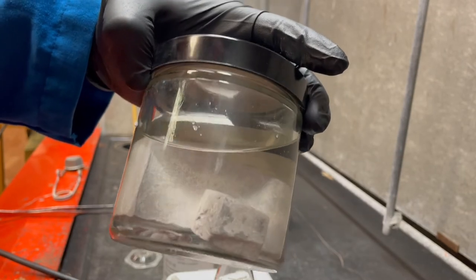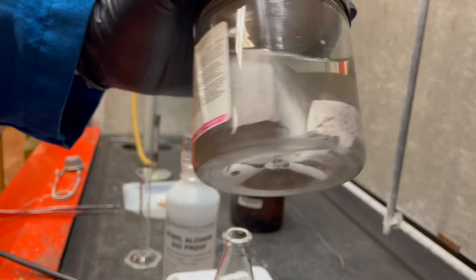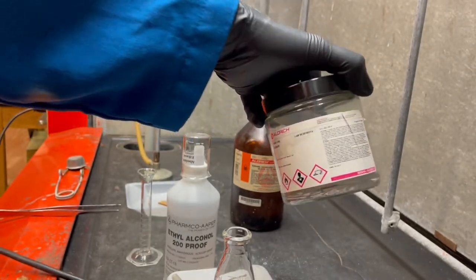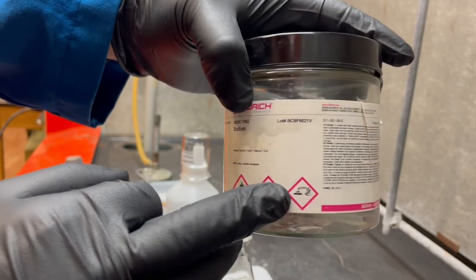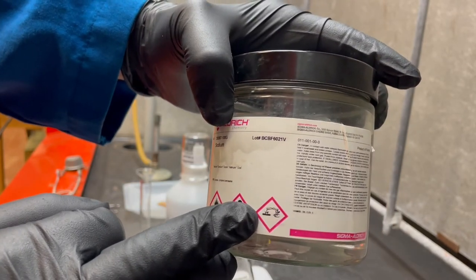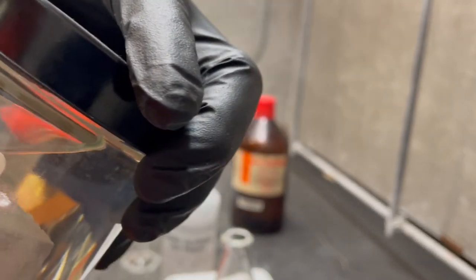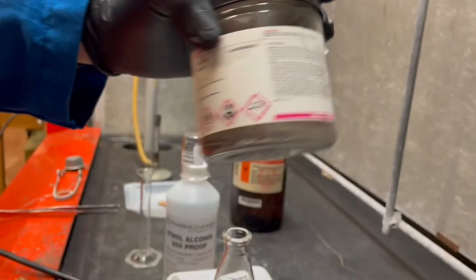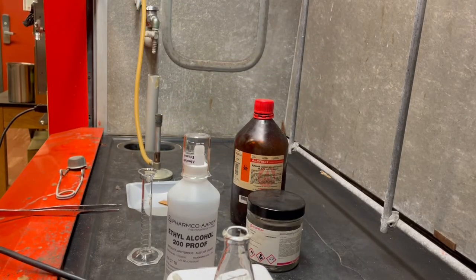So I wanted to, what was I going to say about this guy? Yeah, elemental sodium. It's pyrophoric. You can see it's got the flame on there, the health hazard, and then the hazardous, like don't let it come into contact with your hands. It reacts with water very violently and it forms H2 gas. So what's going to happen when I add it to the ethanol is it's also going to form H2 gas.